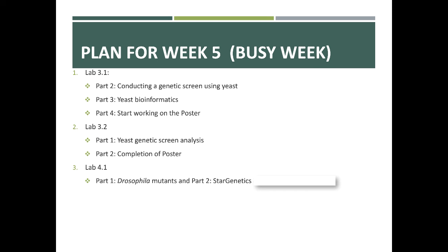So we'll talk about Drosophila mutants. And then there is this program called STAR Genetics. And we're going to use that for some virtual crosses. And in fact, this is what we do in the regular face-to-face labs as well.